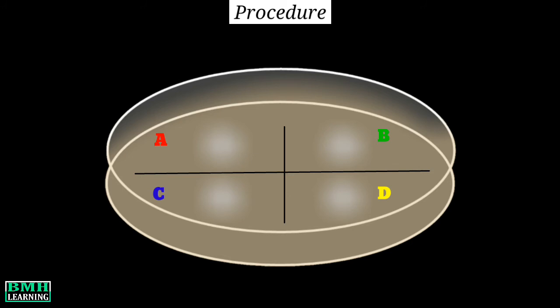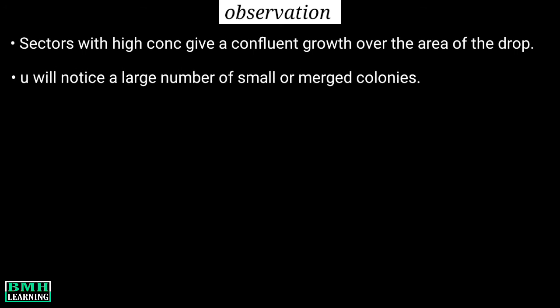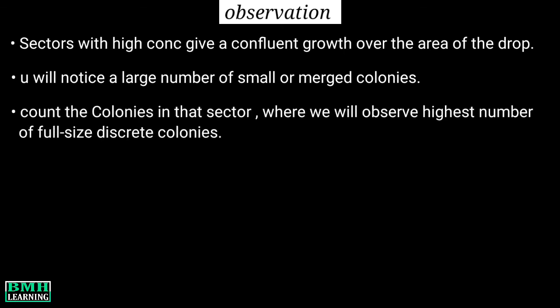The plates are then left to dry and are then incubated at 37 degrees centigrade for 18 to 24 hours. After incubation, we observe each sector for bacterial growth. Sectors with high concentrations will give a confluent growth over the area of the drop, or you would notice a large number of small or merged colonies. We will count the colonies in the sector where we observe the highest number of full-size discrete colonies.